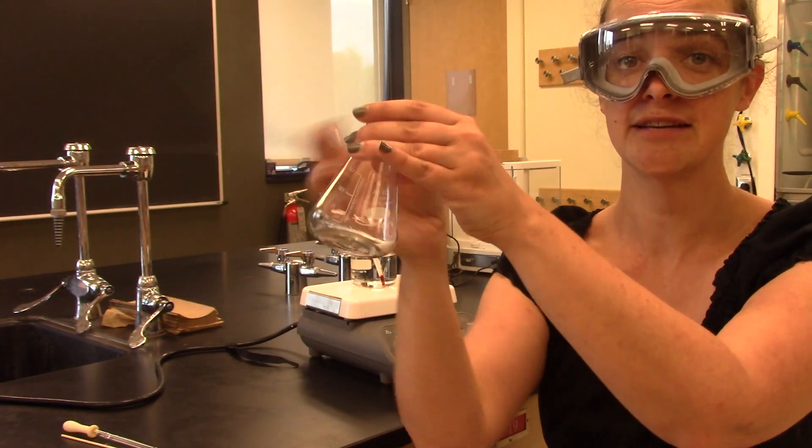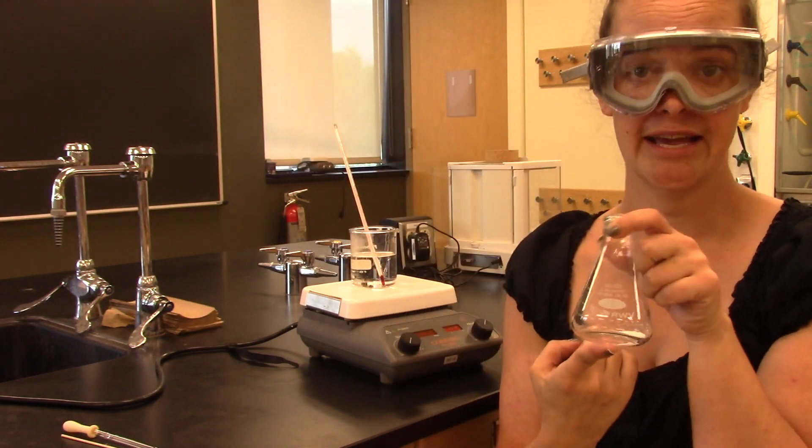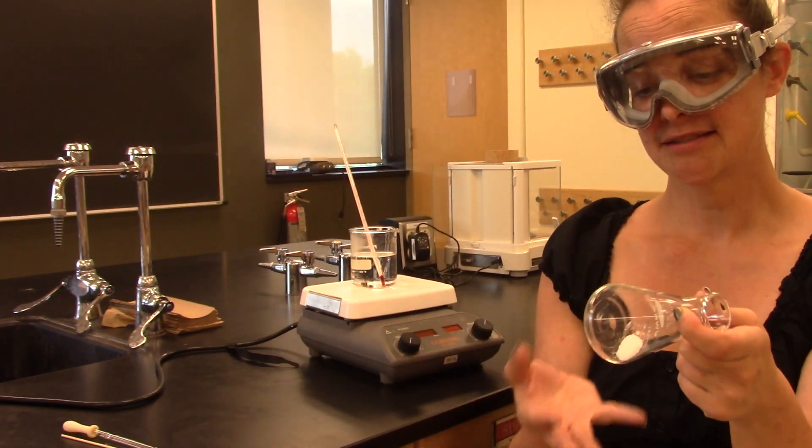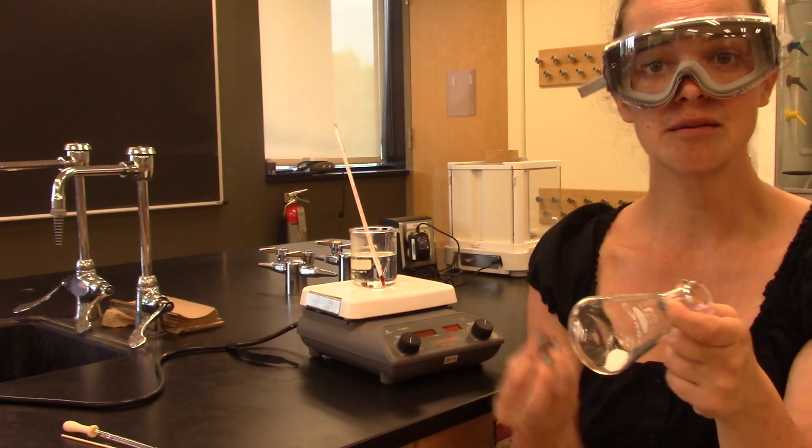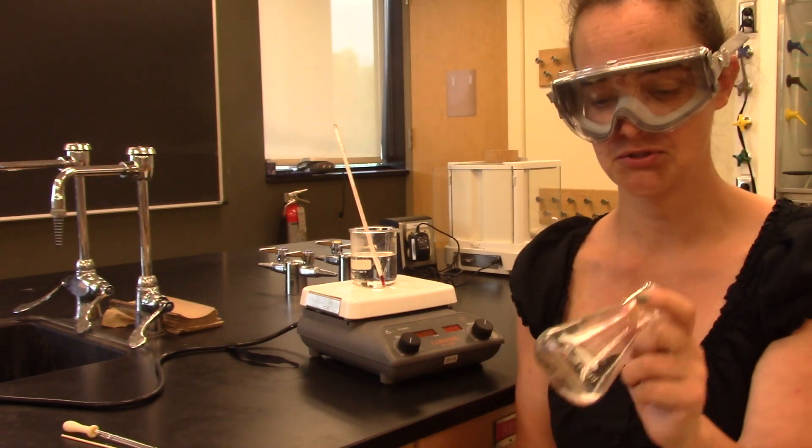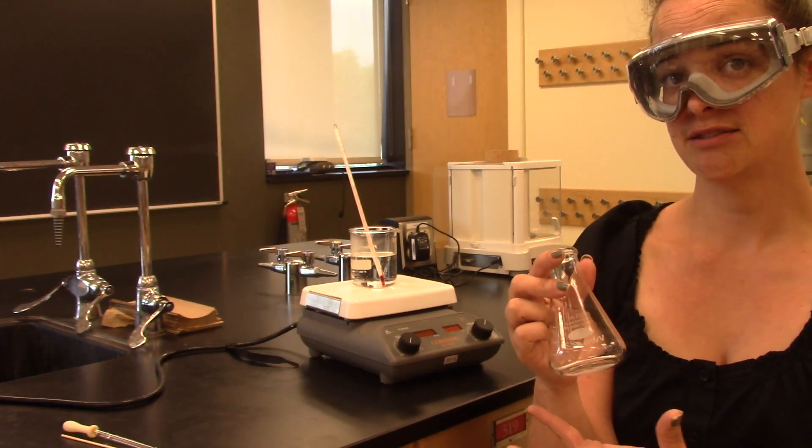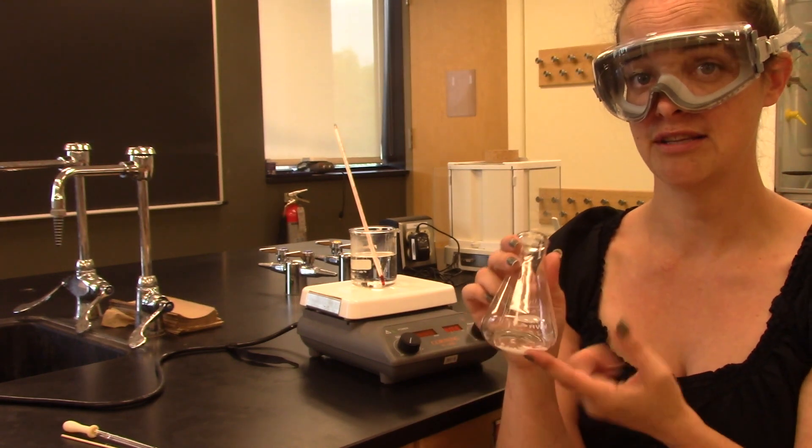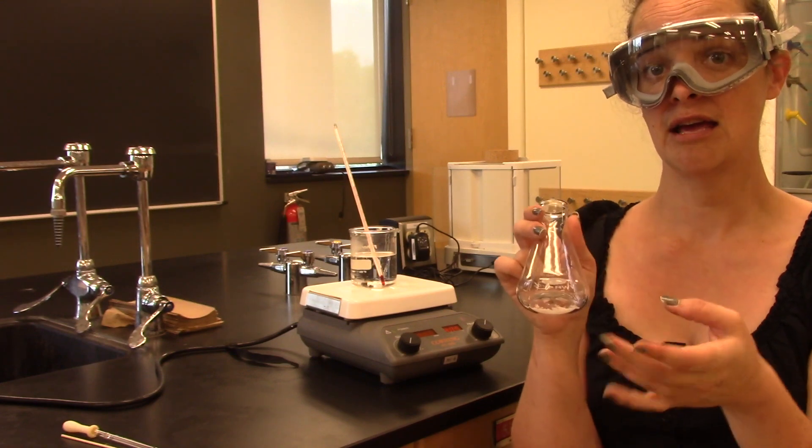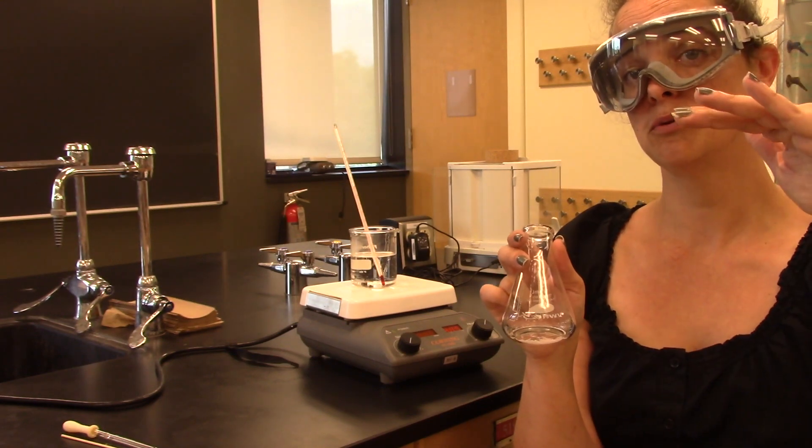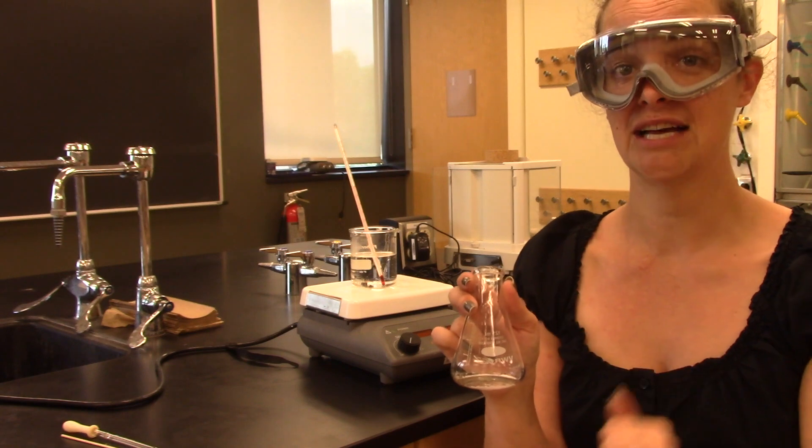I have inside this Erlenmeyer flask about a gram of phthalic acid, but this phthalic acid is not the purest. It's got some kind of impurity trapped inside the crystal structure. So in order to get rid of that impurity, what I need to do is dissolve everything in here and then find a way to precipitate only the pure phthalic acid compound.